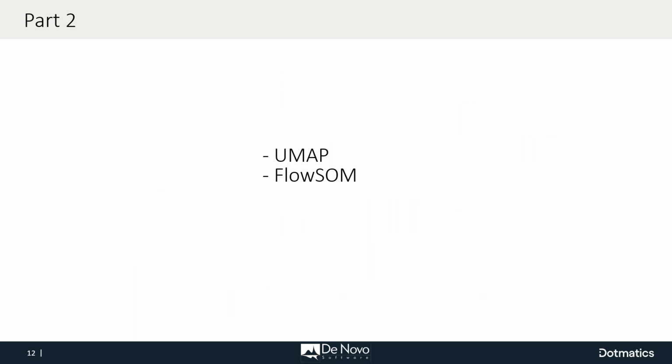So next part, Jeff Tracker will take care of giving you tips on UMAP and FlowSOM. And in this case, we will use OMIQ. So let me make Jeff the presenter. Here we go.